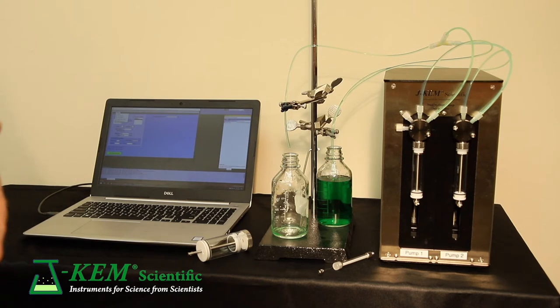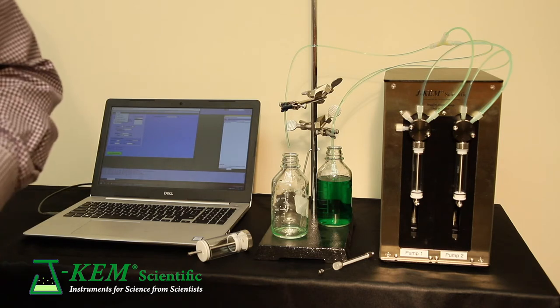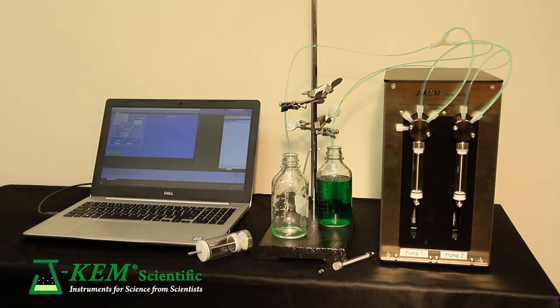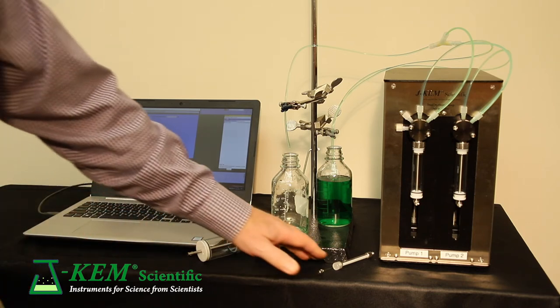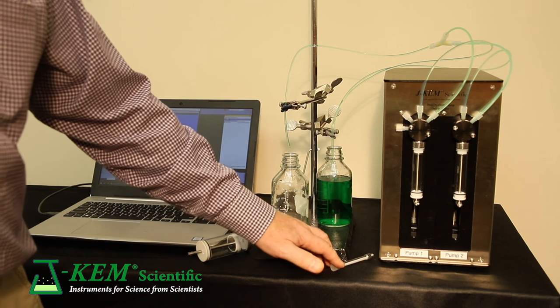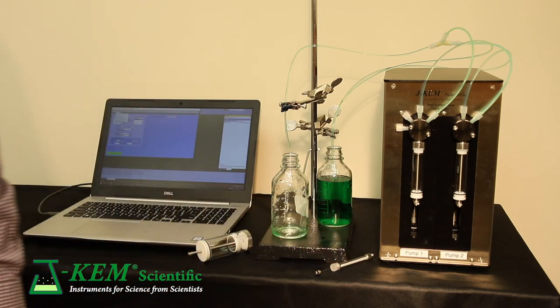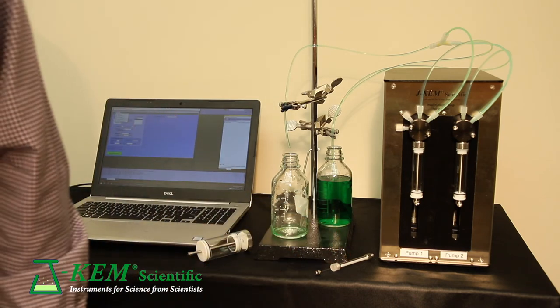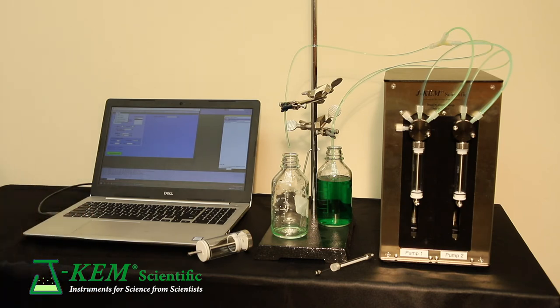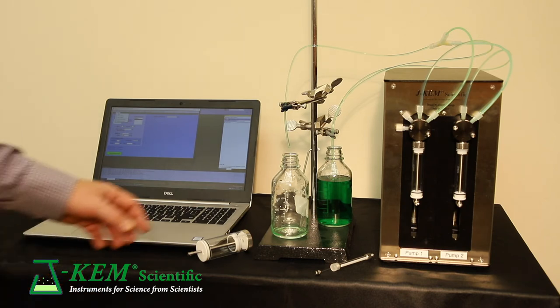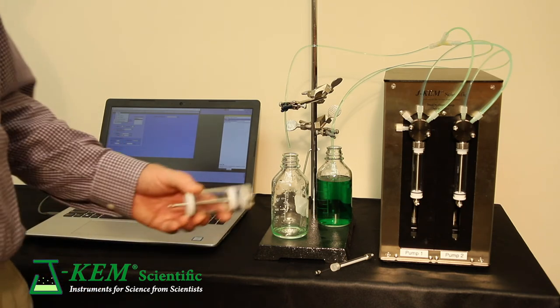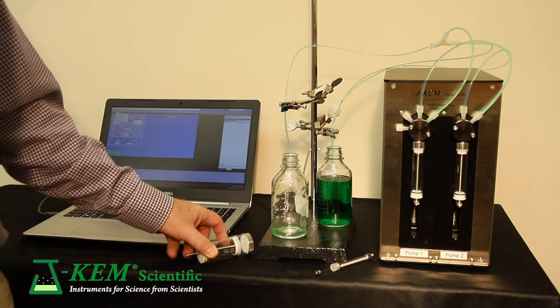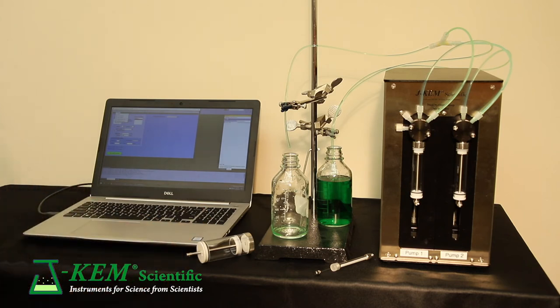What's even equally important is the very wide speed range they have. If you put on a 10 microliter syringe, you can get down to delivery rates as low as 3 nanoliters a minute. And if you were to put on a 50 milliliter syringe, you could get up to flow rates as high as 750 milliliters a minute.